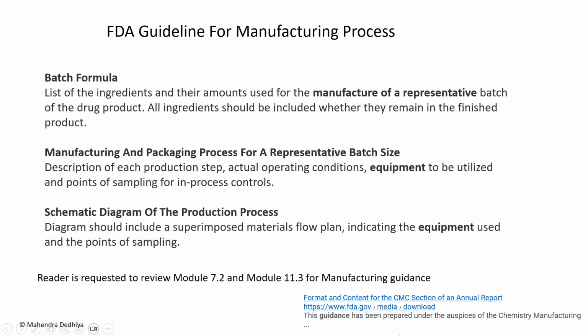Let's look at the FDA guideline. This is added here for the sake of completeness. In this submodule, we need to look at the formulation as is described in literature. It is important to make phases in a specific sequence in manufacturing of emulsion and double emulsion.